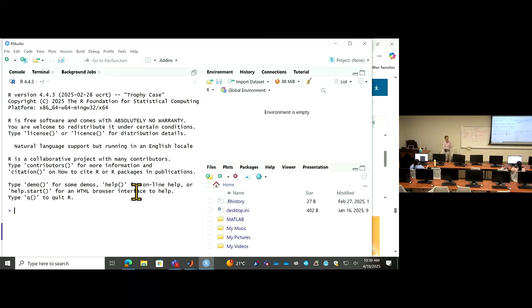Otherwise, you may have to reinstall it from the ZenWorks. Let me know you have this R. We are going to install Harmony in R, and then send the input data from MATLAB to the R and read back the Harmony results.